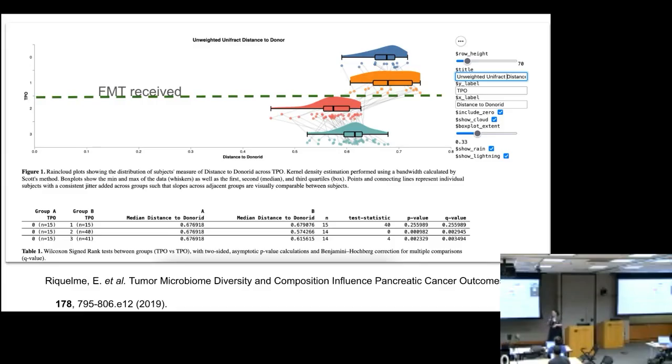But additionally, these are mice. So I'm not that surprised that after a while, we see that some of the human gut microbiomes maybe just didn't live there effectively and survive there. And so I'm not that surprised that there isn't that much similarity between these microbiomes.